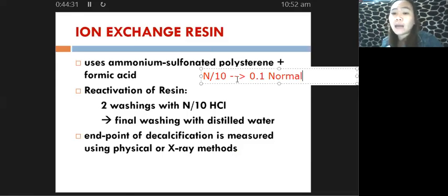So in the laboratory, there are several formulations of RAF that we can use. We have 10% and 20% RAF, which is utilized for cancellous bone samples, your spongy bone samples. And the thickness that is required for your spongy bone has to be 2 to 3 millimeters thick.